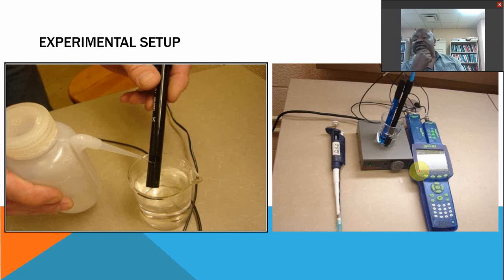Just like we did last week for the iron thiocyanate reaction. All right, moving along. So here's a way to do it. This is our entire setup. We'll put a known amount of distilled water, 60.1 mL or whatever the volume is. Then we're going to add an aliquot of a known concentration of acetic acid or ammonia, whatever it is, and then measure those corresponding things. From those, we'll do the experiment.